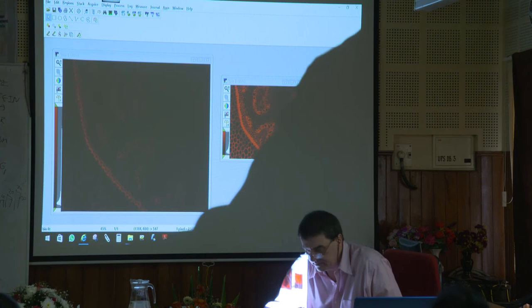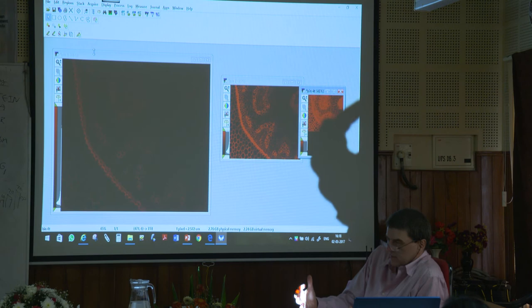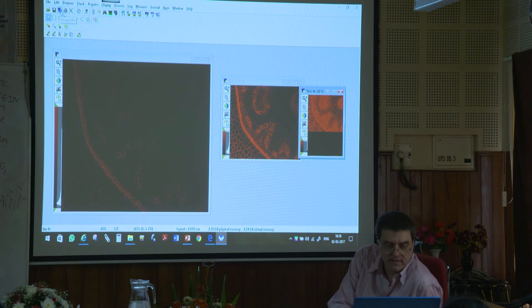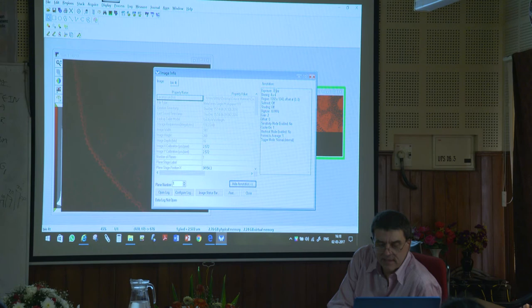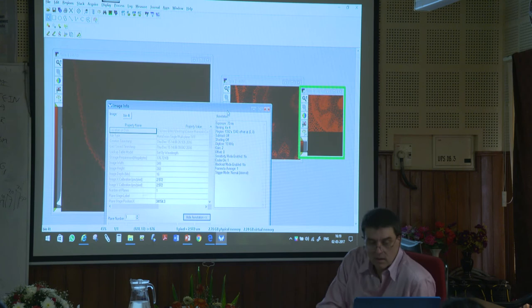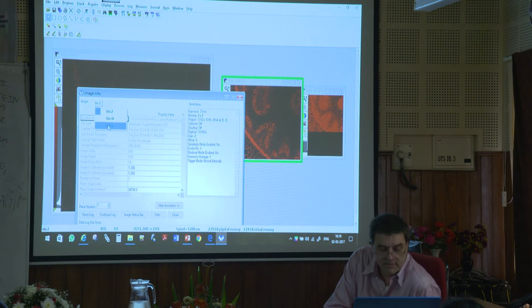Okay. So, the reason I show this, remember we talked about binning and what it was. It's giving the camera bigger pixels and making it brighter. The exposure here is exactly the same. When I took these pictures, I used the exact same exposure. And how do I check that? Remember I told you about MetaMorph, get this little eye? We go here to show annotation, it says 70 milliseconds, binning for bin 4, 4x4. It tells me right there. Right, 70 milliseconds, 4x4. Okay, if I look at bin 2, 70 milliseconds. And then if I look at bin 1, right, 70 milliseconds. They're all the same picture, different binning though.